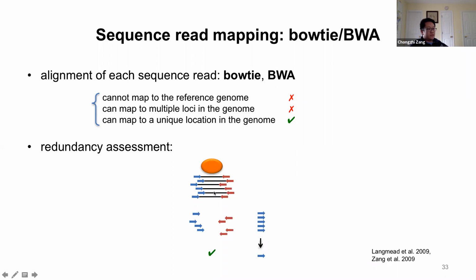If we compare different cells, for either nuclease digestion or sonication, say a transcription factor molecule or a histone or nucleosome, they will associate with a part of the sequence that is usually at least 50, or usually more than 100 or 200 base pairs. And the cleavage location across different cells is very rarely the exact same base pair location across the genome.